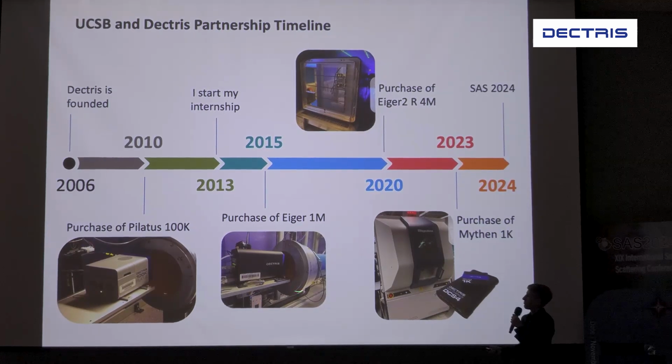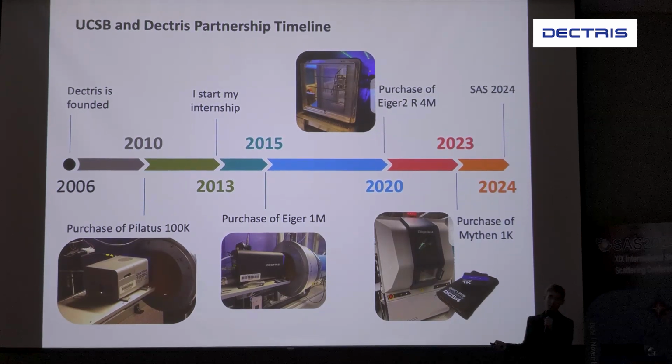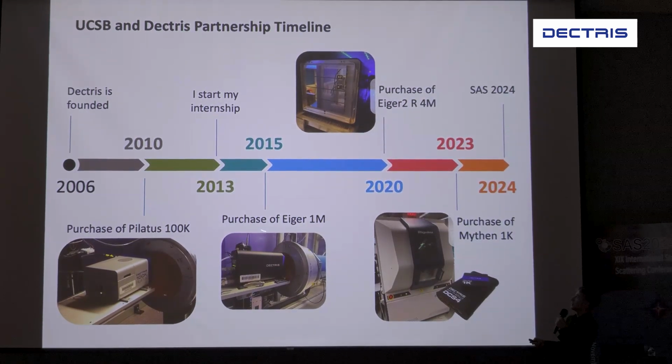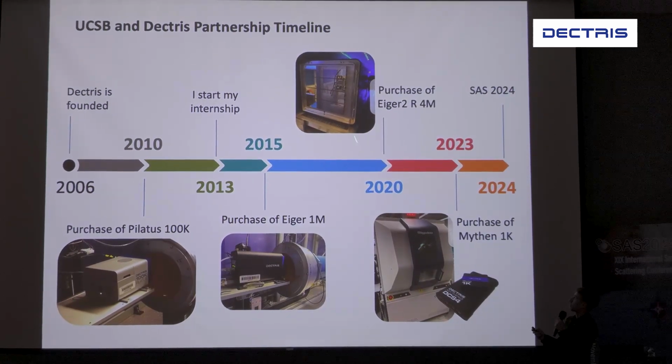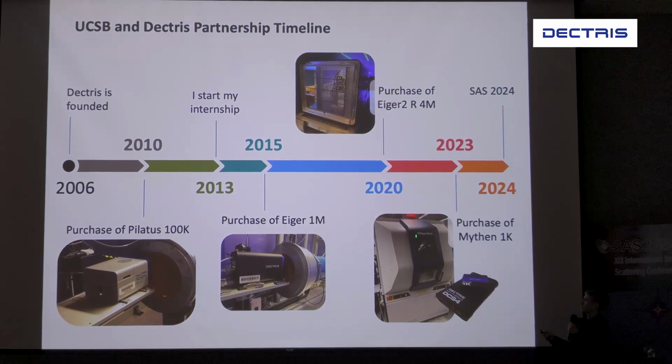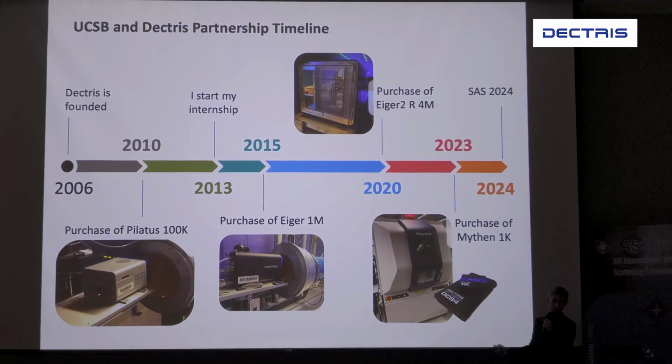A couple years later, we bought the EIGER 1M. Another fun fact, this was the first EIGER sold in the US, one of the very first ones sold in general. And then in 2020, we got the Bio-Pacific proposal to buy the EIGER 2 4M, which I will be talking about. And most recently, we bought a Mythen detector. We're repurposing our old zero-gen Rigaku SmartLab for high-energy molybdenum source powder diffraction.